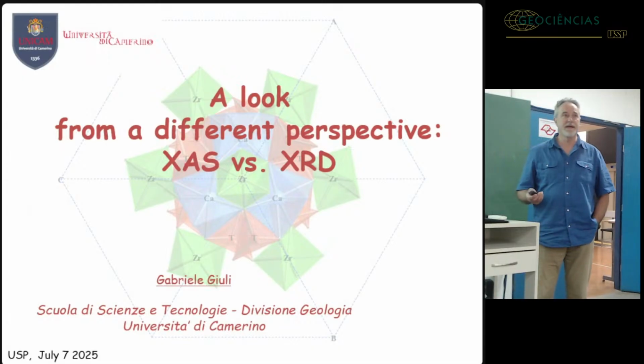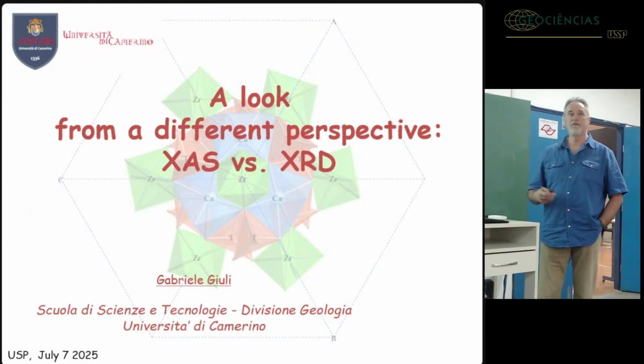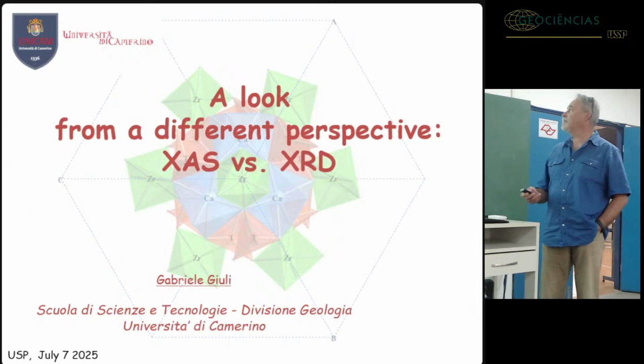First of all, thank you for hosting me and also for coming to this seminar. I prepared a short seminar on the comparison between X-ray absorption spectroscopy and X-ray diffraction. They are two now widely known techniques, each one with some advantages or some disadvantages.